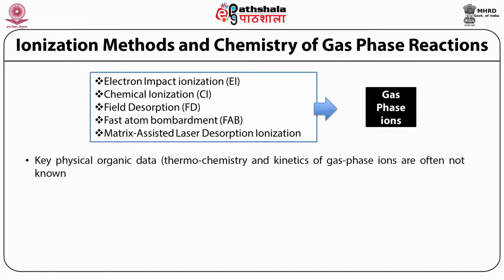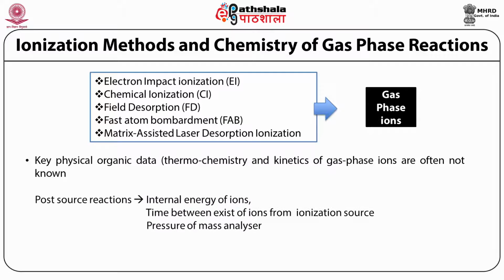However, key physical organic data about these reactions which are happening in the gas phase, especially thermochemical reactions and the kinetics of these kinds of reactions, are not often known. The post-source reactions, especially internal energy of ions, time taken between exit of ions from the ionization source, and pressure of the mass analyzer, make a lot of difference once the molecule is ionized by the ionization source, towards the detection. In between these two events, whatever is happening depends upon all these factors.